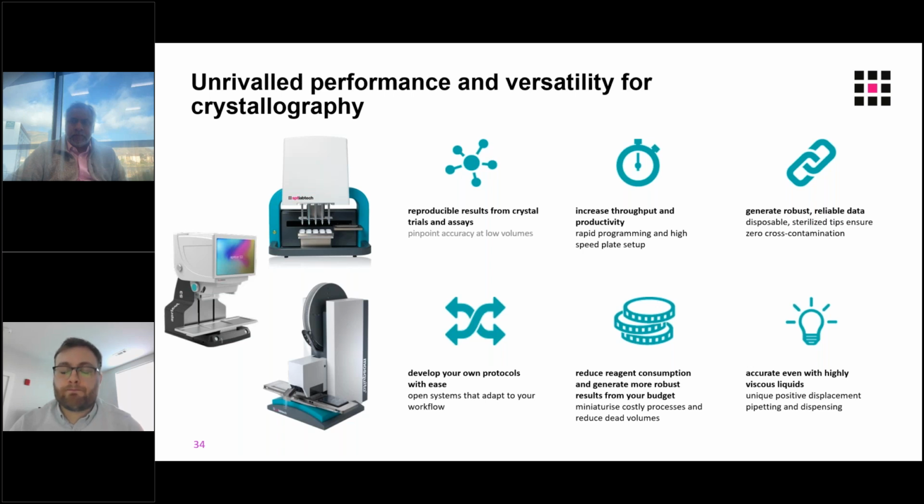Great. Do these instruments remain clean and sterile enough to work with RNA? Yes, all of them use disposable, single-use tips, making sure that contamination is minimized. From personal experience, I can attest that the Mosquito is excellent at setting up RNA crystal trials. It is clean enough and RNA-free enough to use for RNA crystallography reliably. The Apricot tips can come filtered and sterile to make sure that your transfers with those are very reliable.